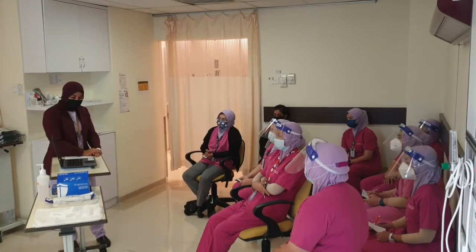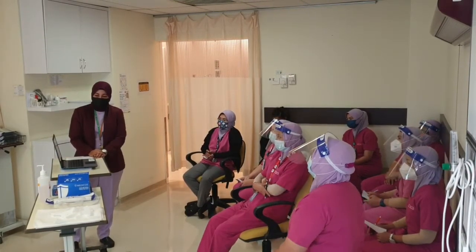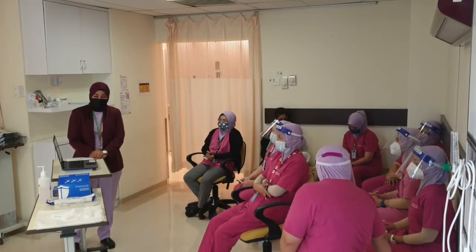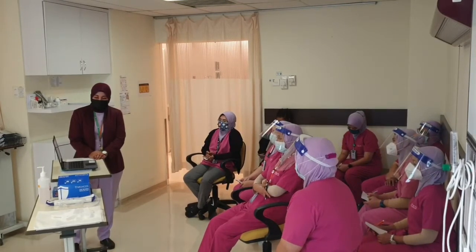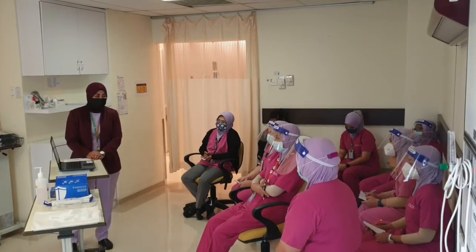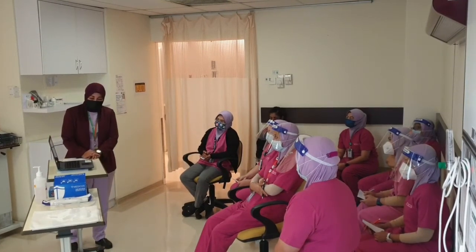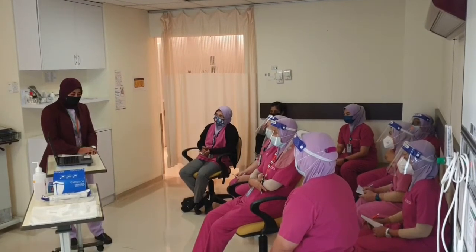Learning objectives. Number 1, define PPE and identify those relevant to the safety of healthcare personnel. Number 2, explain the regulatory role of the FDA as it relates to medical devices and the rationale for the classification of medical devices, for example PPE. Number 3, demonstrate the steps to follow for putting on and safely removing PPE.